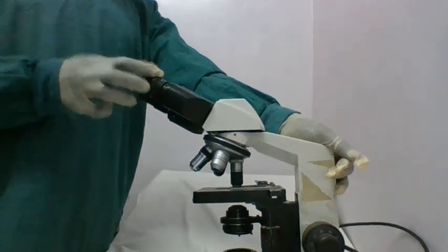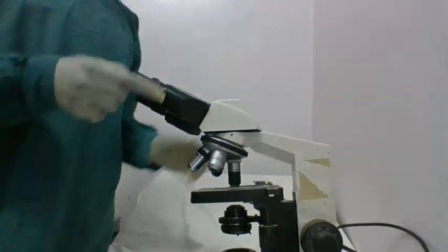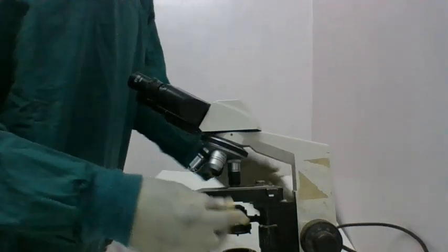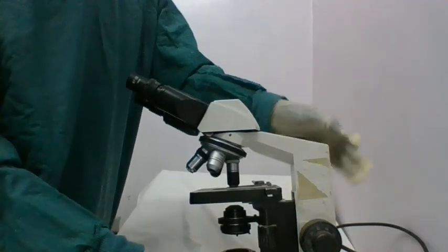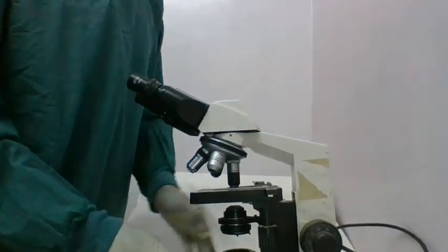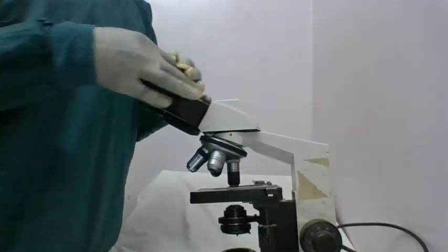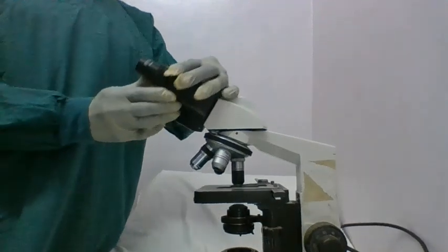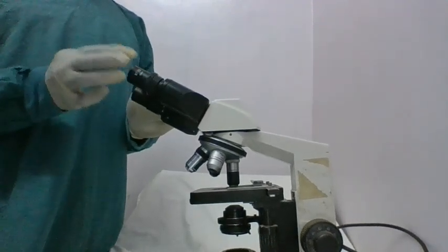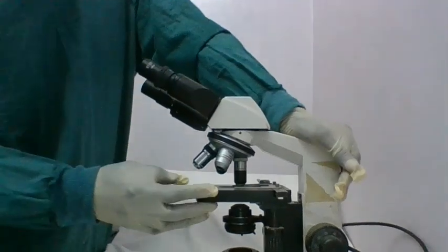The biomed will not come there and sit, guide you, and watch how you use the microscope. You are the one to make sure that you properly use the microscope, you properly store it, and you cover it from dust so that the lenses, here are the lenses of the microscope, do not become covered with dust.